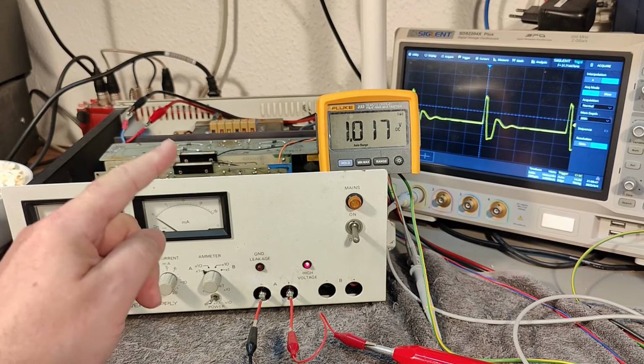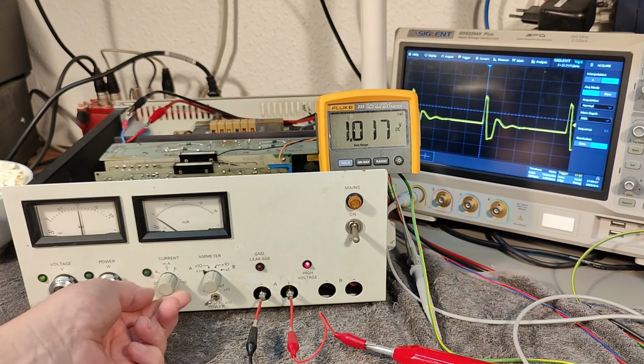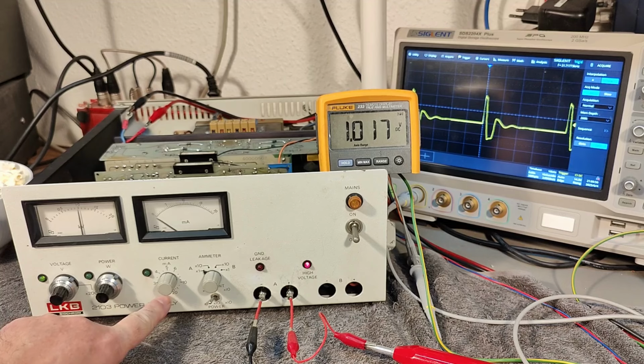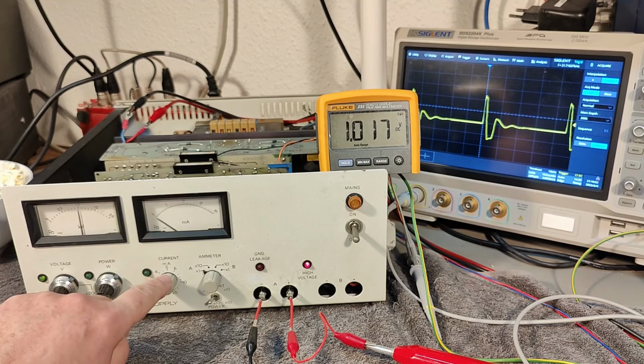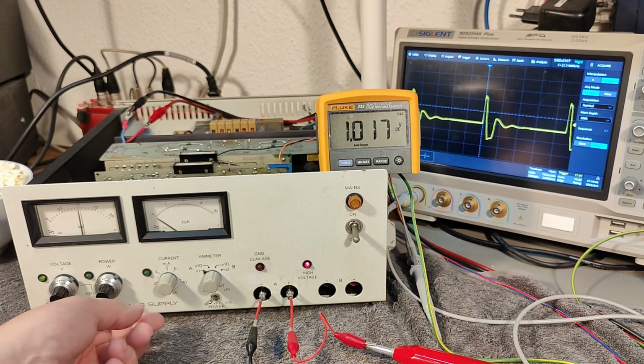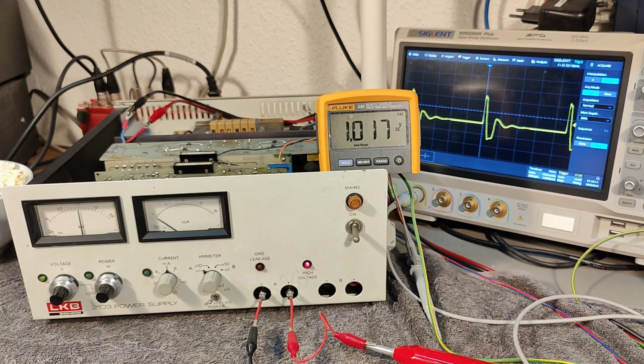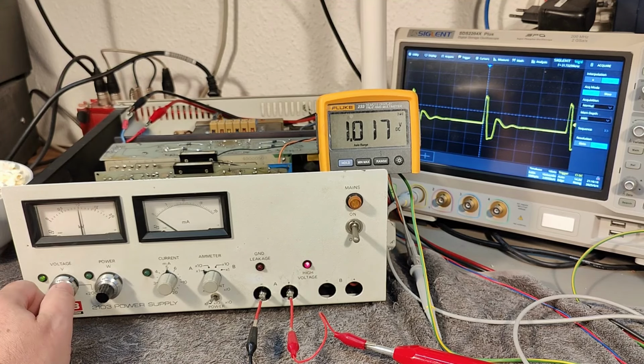No, there is also no load. So probably this is not working. So I should be able to try and load it and see if that is working. So far it's not going to 0, but it says here actually 2 milliamps as the minimum. So we need to have at least that before this one should work. So this is what I should expect. Okay, fine. So let's at least just try the 2 kilovolts of output and see if that is working before we call this a success.